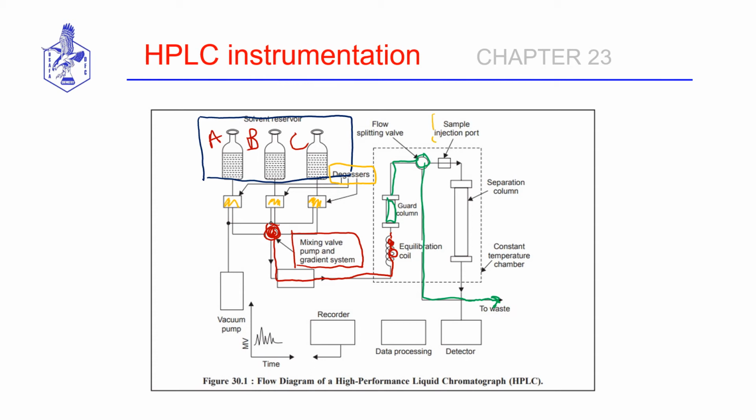We do so with what's known as an injection port. Okay, with an auto sampler, there's a syringe that sits on top and a rubber septum will be penetrated and it will drop the appropriate amount of sample and introduce it into the injection port. Okay, from there, the mobile phase sweeps the sample onto the head of the analytical column.